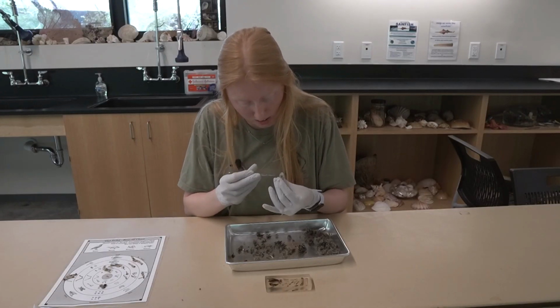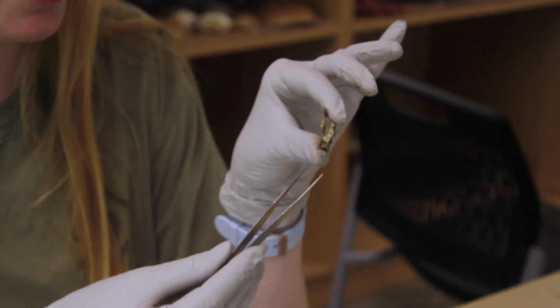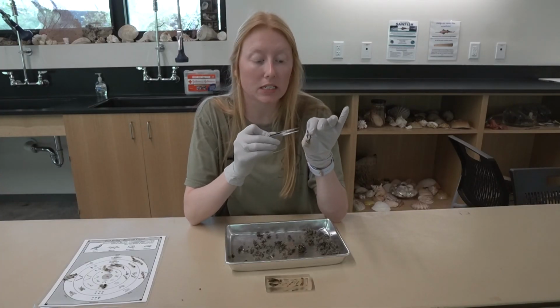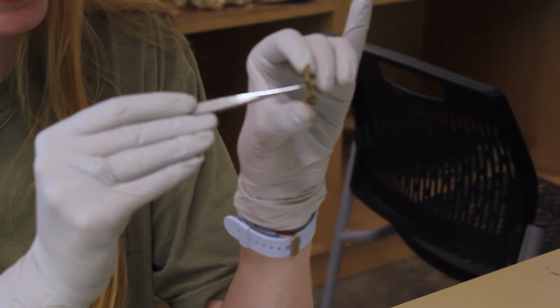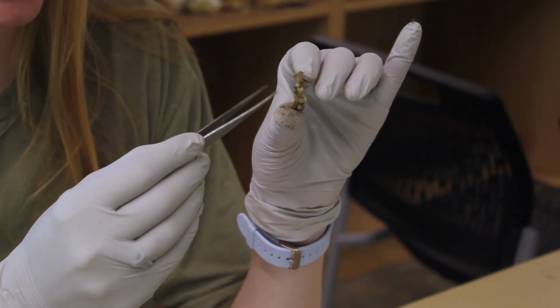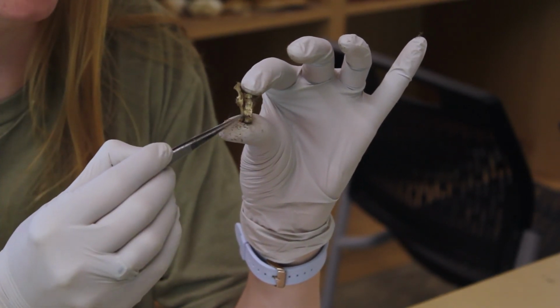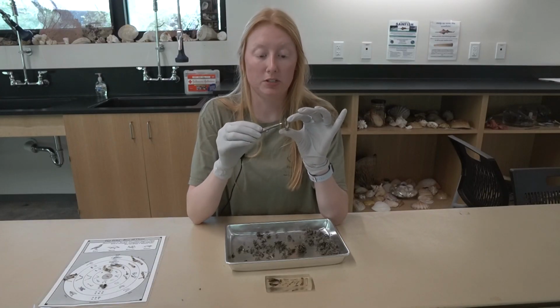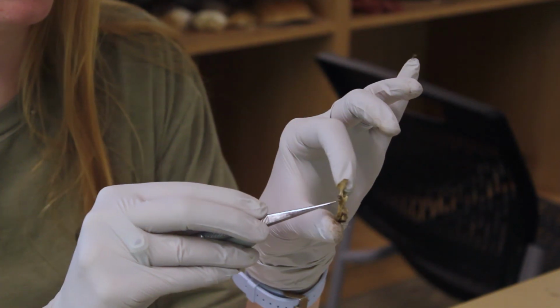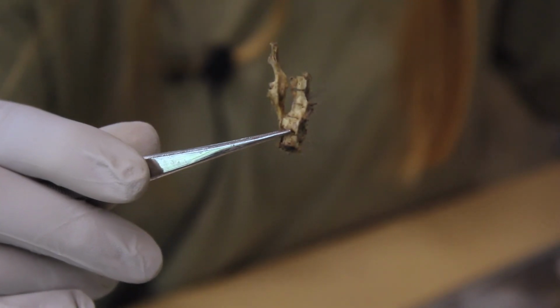Okay, this is neat. We have a section of vertebrae right here, which seems to be attached to maybe a scapula or some other kind of front leg, hind leg joint. You can see right there that I would honestly say this is probably from a bird, because of how the backbone is fused with the scapula. It comes to a connect right here. Since some birds' backbones are fused, I would assume this is from some smaller species of bird, obviously smaller than an owl, and this is where the arm bone from that wing would connect right here. So this is a really, really cool find, one that I haven't ever seen before.